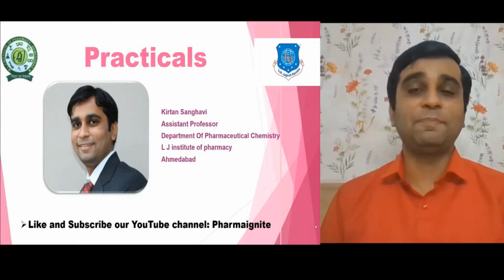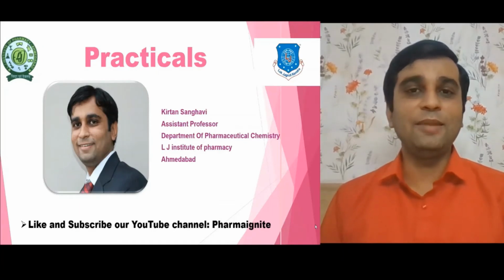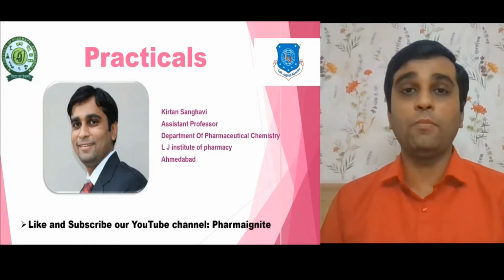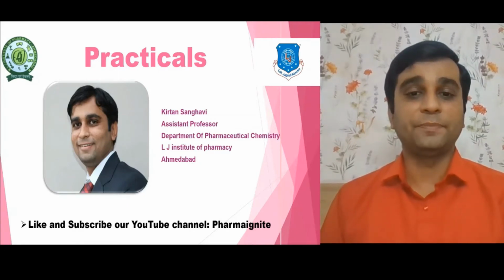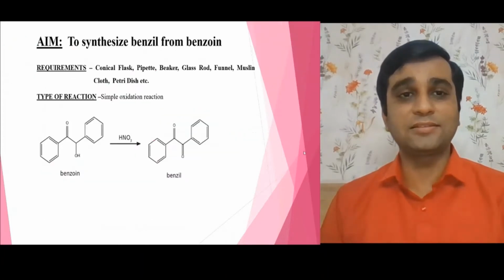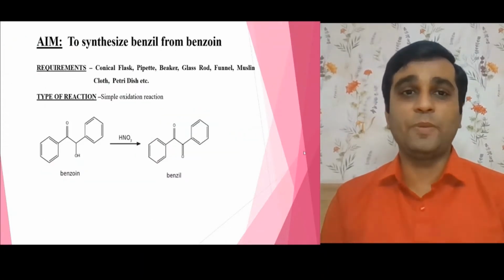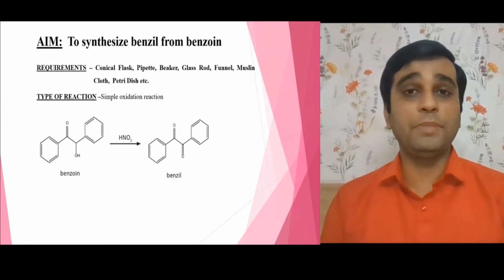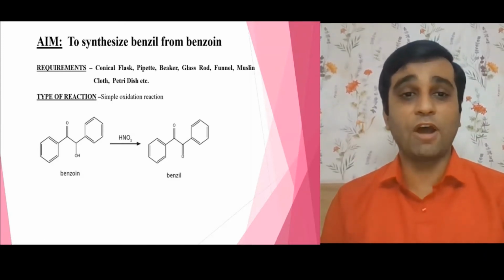Let me today start with the practical session. The aim of today's experiment is to synthesize benzil from benzoin. Now, if I talk about the synthesis, generally the practical requirements are, of course, a conical flask, pipette, and beaker. These are the essential requirements.